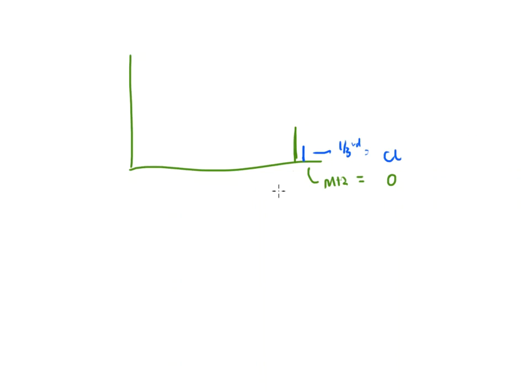I've just identified a weird little atom that doesn't show up most of the time, but if that M plus 2 peak's present, and it's about 1/3 of the abundance of the M peak, that's a good sign that chlorine's there. And then, if it matches the height, this is a very good sign that bromine is present. Because think about it, this was a 50-50 split.